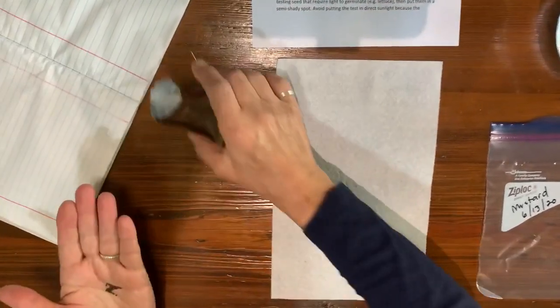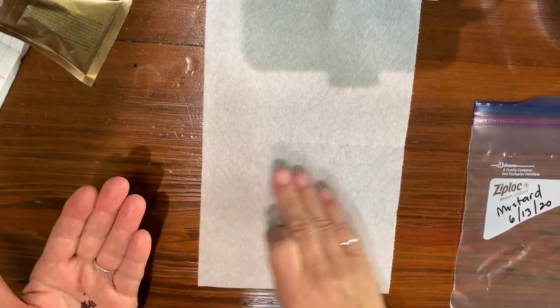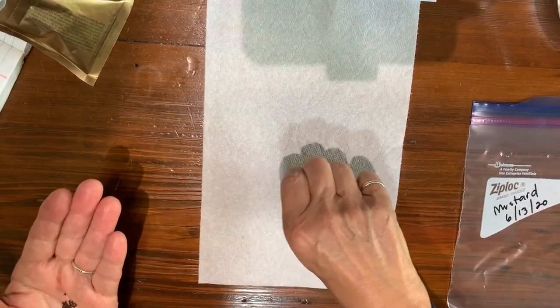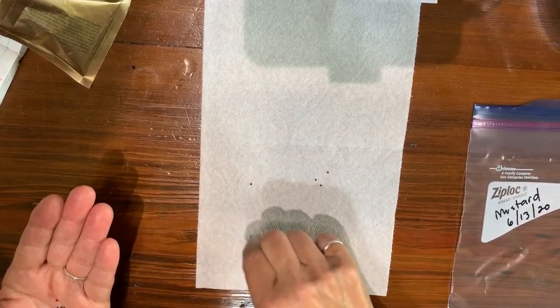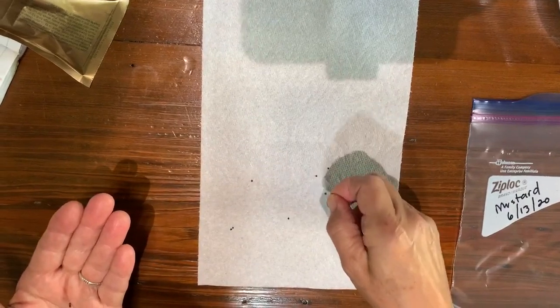Try to get 10 seeds on here — these are very small. I want to spread them on the bottom half of this paper towel piece. Spread them out; you don't want them touching each other. I'll get 10 on there and then get them spread out.